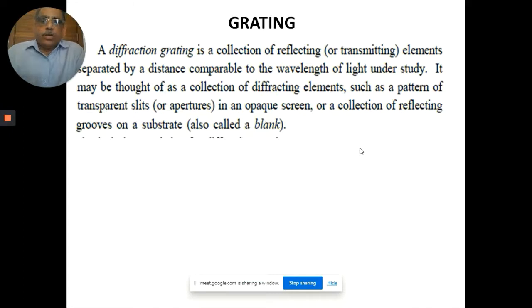So what is this grating? Basically they have grooves. Actually they have lines drawn. They take a small glass plate, they draw the lines. It works like a diffraction, as we have studied diffraction law. So the lines are diffracting the light and dispersing the light that you're using.